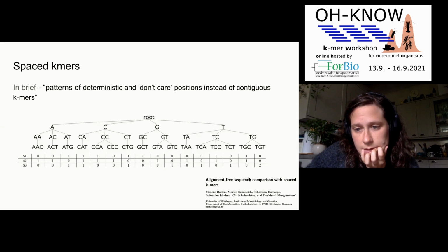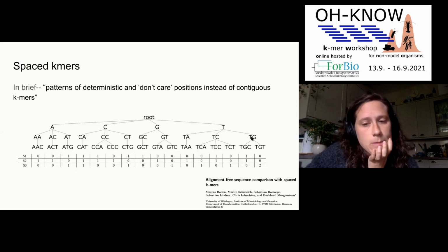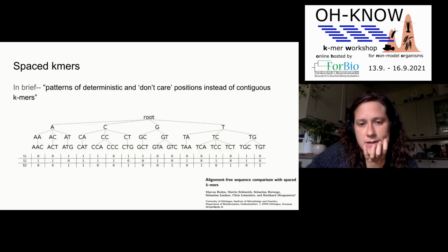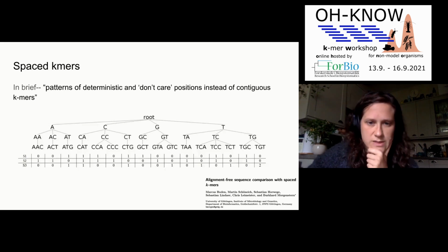So this is used for some other techniques, like in this paper on alignment-free sequence comparison of spaced Kmers. I had a look at the paper and it looked really interesting for some specific methods, but we didn't really go much deeper. We just wanted to let you know that we can use Kmers in a different way, not using all the possible Kmers in a specific read.